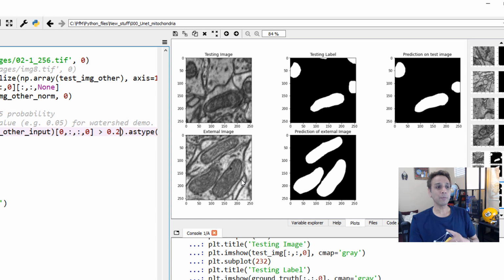But please be careful that wherever you have these objects very close by, these two probably would be combined together, and you may have to find tricks to separate them. This is what we call instance segmentation. In fact, I'll record a video where we intentionally get not so good segmentation, and then see how we can separate these objects to create an instance segmentation, and then calculate object properties and report them. Okay, I promise to do that in the next 2 or 3 videos anyhow.